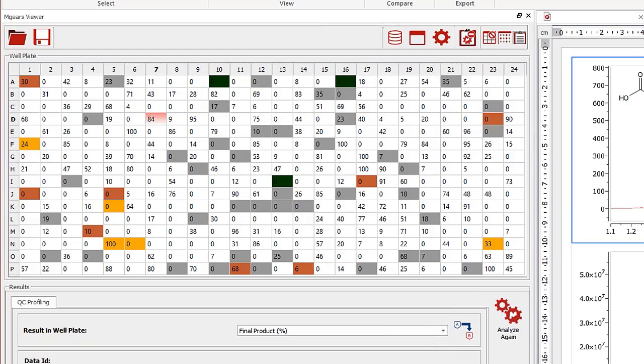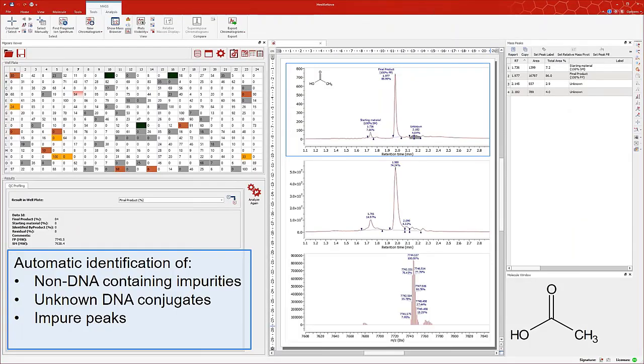so the samples you want to check, Mnova includes a full bunch of functionalities, as, for example, the set of alerts I just mentioned. By the way, all these colors are customizable, so I chose these colors. And here in this case, we have, like here or here in brown, small molecule impurities, where we assume that those will just disappear by using standard macromolecule purification methods as, for instance, ultrafiltration or SEC or gel.